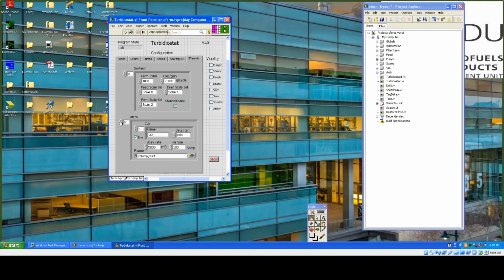The other thing one can do with the archiver is create several independent archivers. Obviously, if we're running several different channels of the system at once, we might want separate archivers for each one. Or if for some reason you wanted several different archivers looking at very similar data, you could just set them up. I'm thinking this would be if you wanted very different scan rates and didn't feel like post-processing the spreadsheet files.